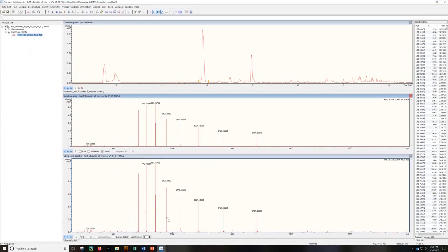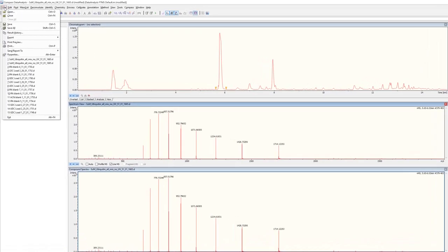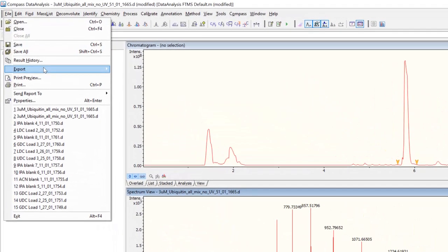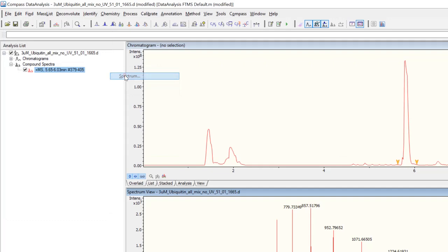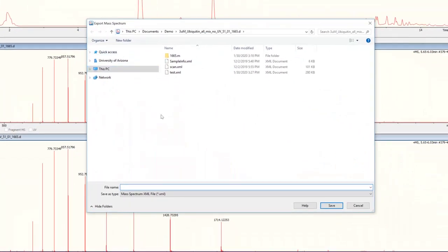For example, if you are using Bruker's data analysis software, as you see here, you will need to use the Export Spectrum As option and choose Simplified XY ASCII. You can now open this file in Unidec.